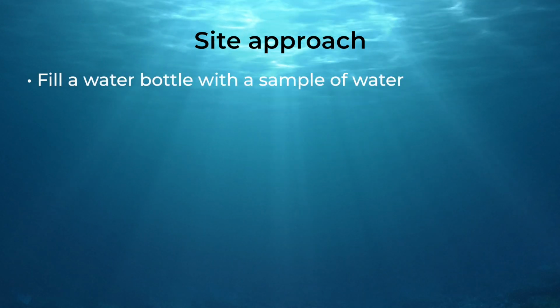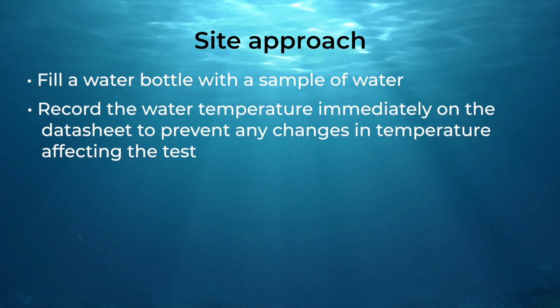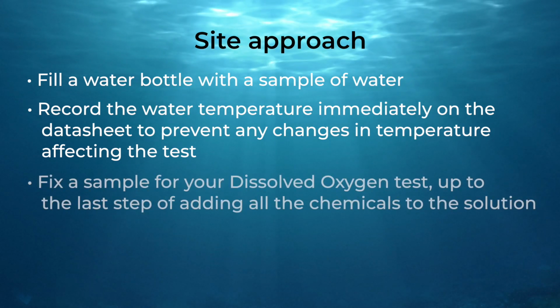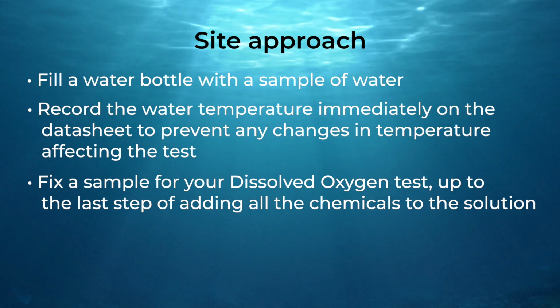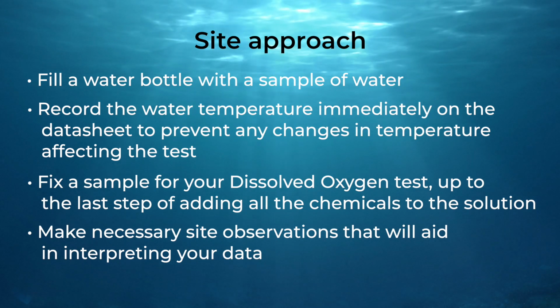Fill your water bottle with a sample of water. Record the water temperature immediately on the data sheet to prevent any changes in temperature affecting the test. Fix a sample for your dissolved oxygen test, right up until the last step, adding all of the chemicals to the solution. Make necessary site observations that will aid in interpreting your data.